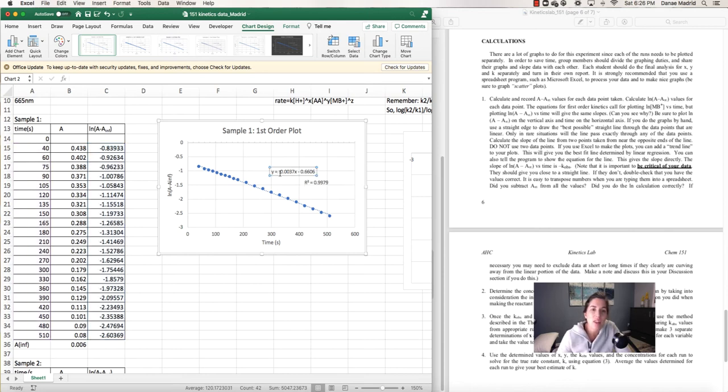Okay, so then we don't really need our R squared value. It's nice to know that it's a relatively good fit. R squared as close to 1 as possible is a better fit and just tells you that the data do align with a linear relationship. But what's really important for you to have is the equation of the line.